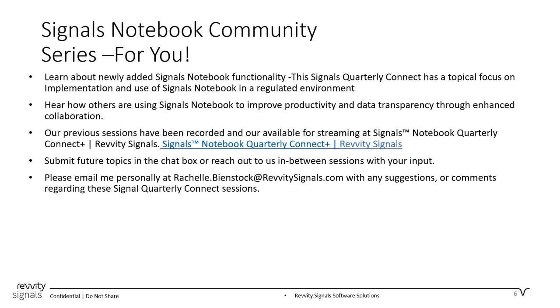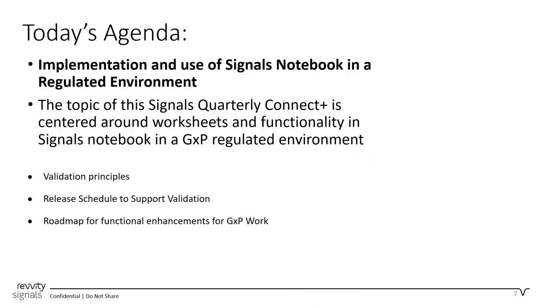So now let's go to our agenda for today. Today's agenda, as I've said, is implementation and use of the Signals Notebook in the regulated environment. We're going to discuss validation principles, the release schedule to support validation, and the roadmap for functional enhancements for GxP work.